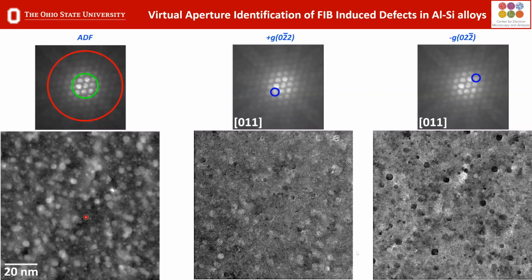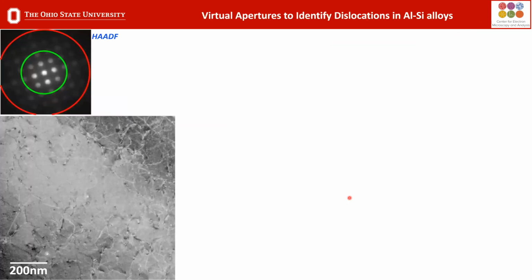If you're critical in your analyses here, and with the EMPAD, that means taking one image, you can go through and verify what you have.